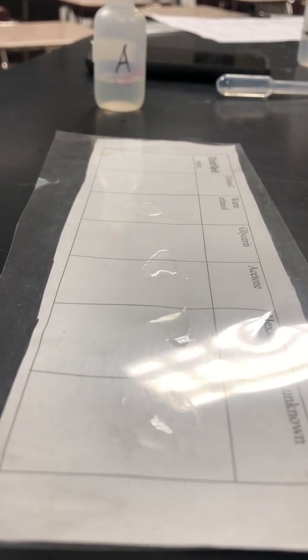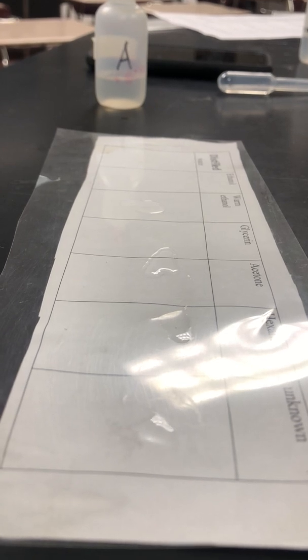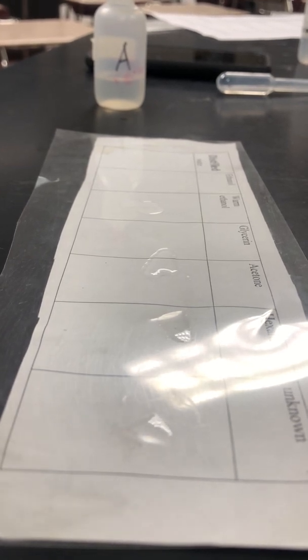At a higher temperature, the liquids will evaporate a little faster. I would say that the hexane is gone, and so is the unknown. Is it moving anymore? I'm not seeing any movement on either. And the acetone is fading fast.